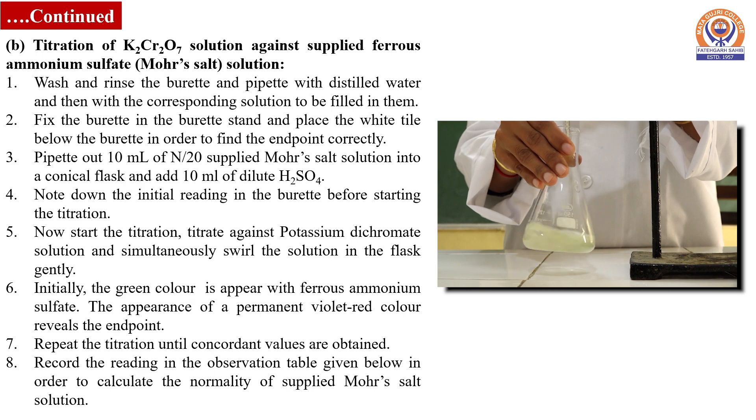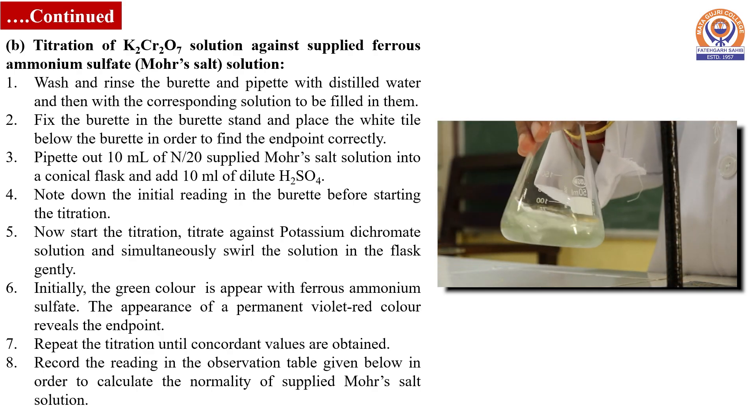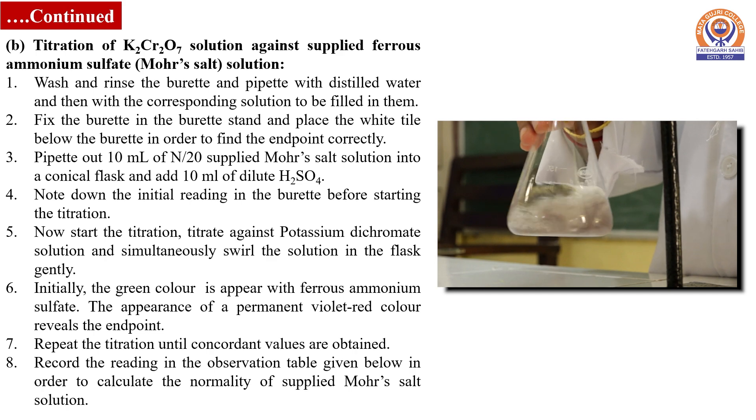Add 2 to 3 drops of indicator, which is N-phenyl anthranilic acid, in the titration flask. Start adding potassium dichromate solution from burette to the titration flask, and at the endpoint the green color of the solution will change to violet-red. Note the volume of potassium dichromate solution which is used for the titration.